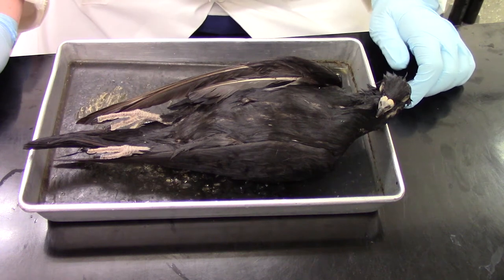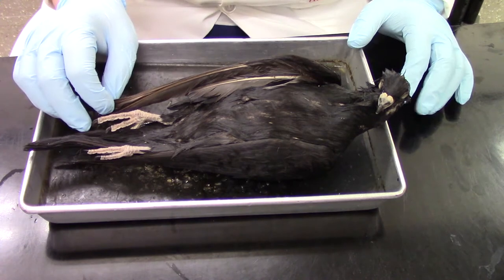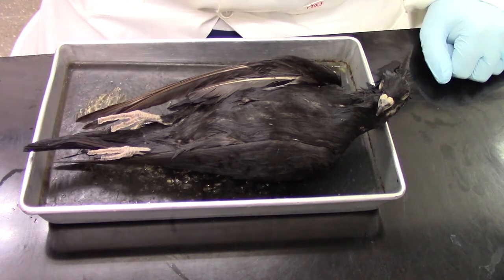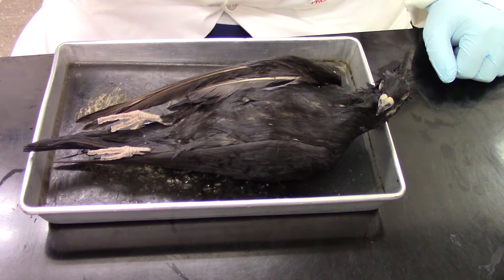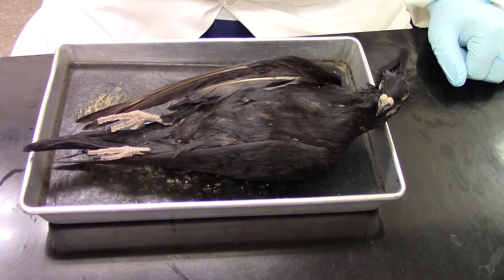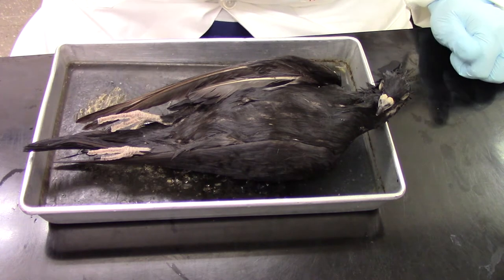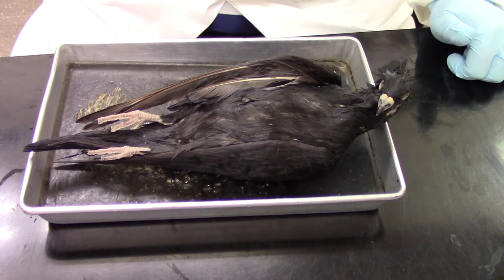Hi everyone. I'm going to be walking you through the pigeon dissection today. Here we have one of our pigeons. It is fresh from the vacuum packaging, so the anatomy doesn't quite look as natural as if we were looking at a bird outside, but we could still get some of the main anatomical features here.